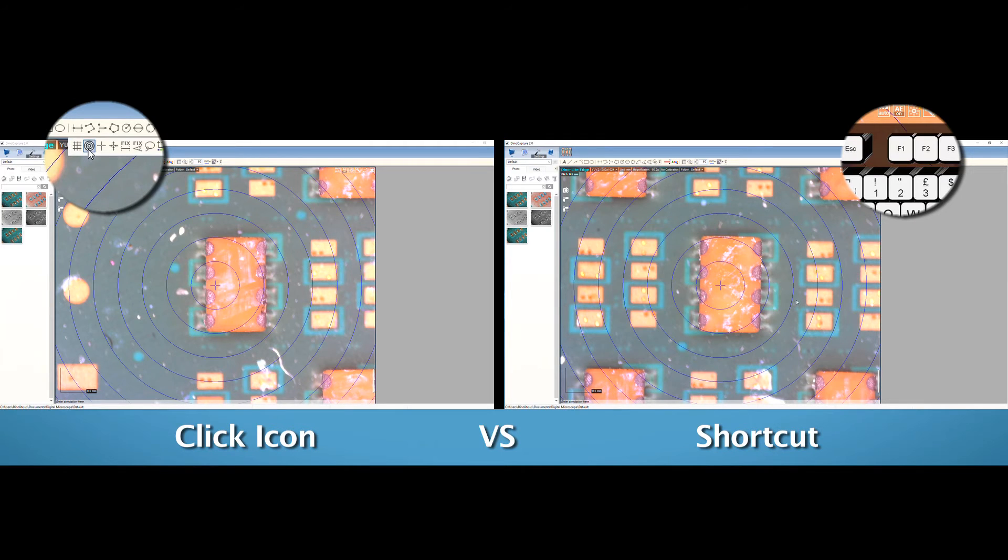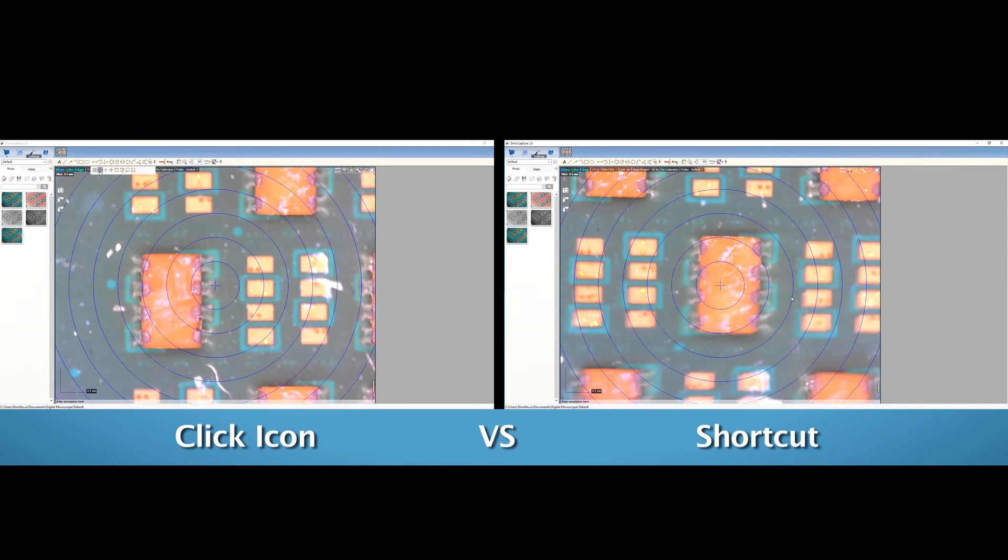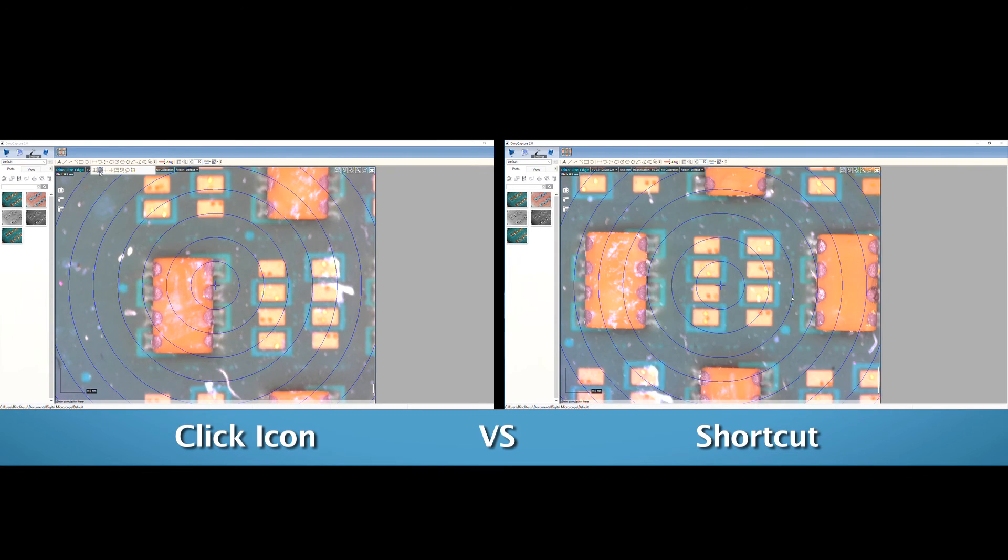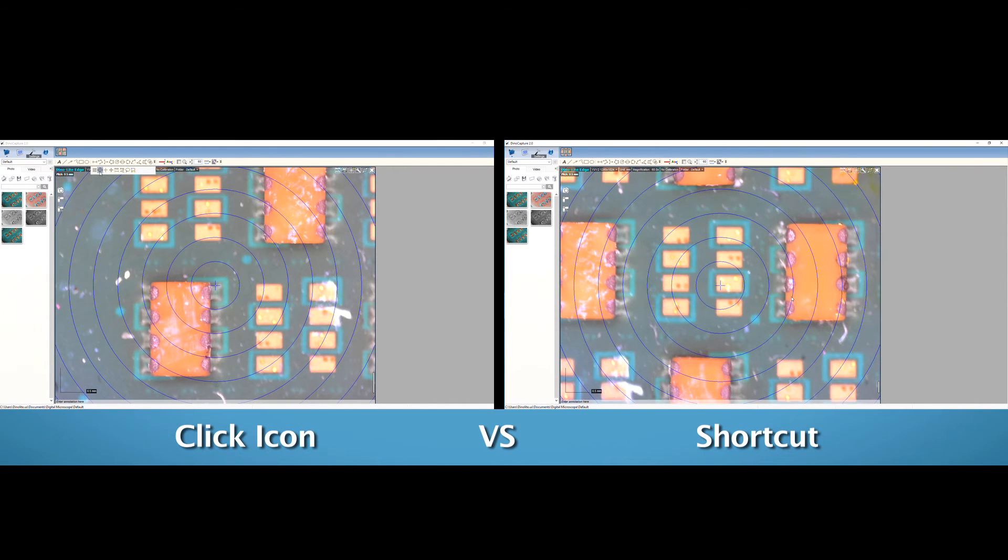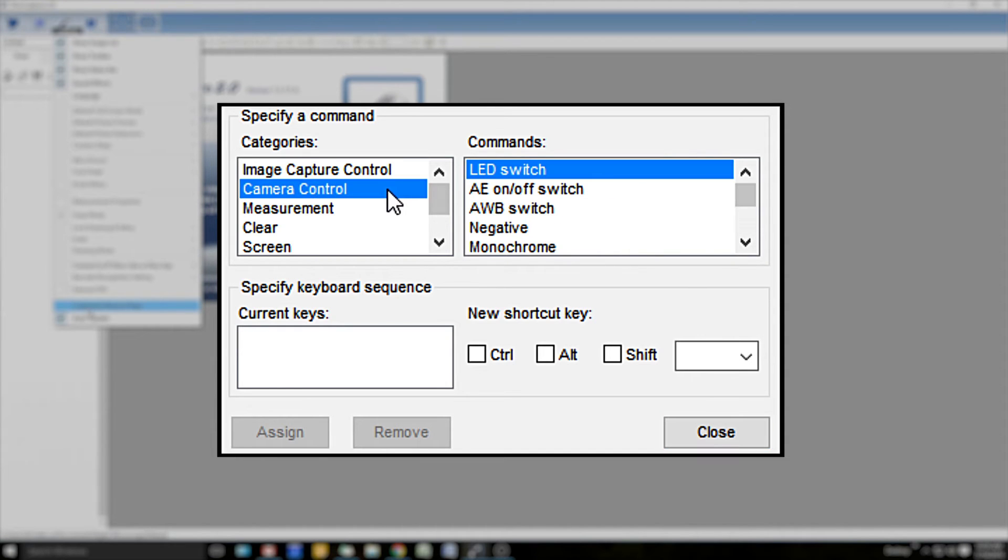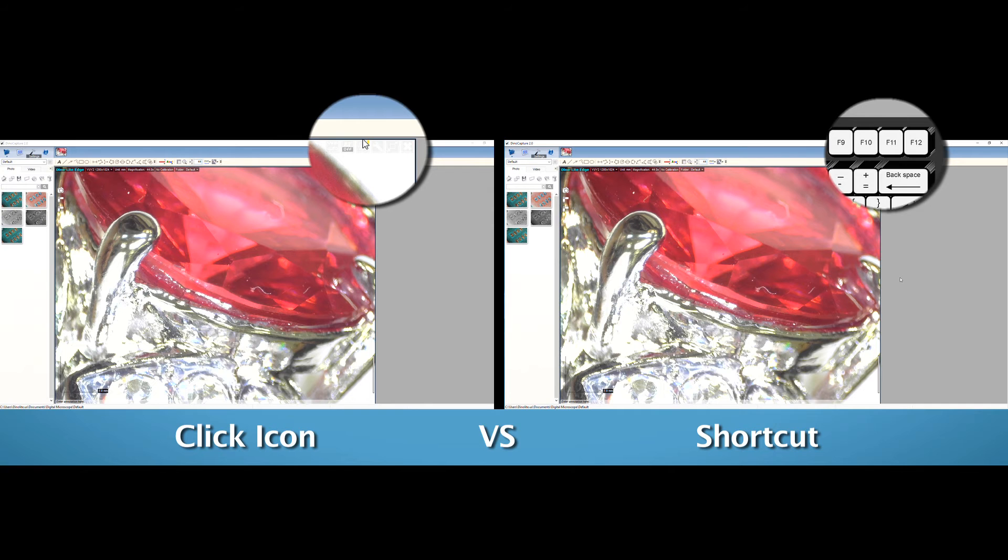DinoCapture is constantly being updated with new features being added to improve the quality of the software and efficiency in use. As a reminder, all updates are free for DinoLite users.